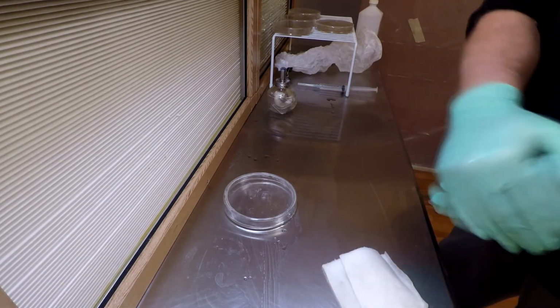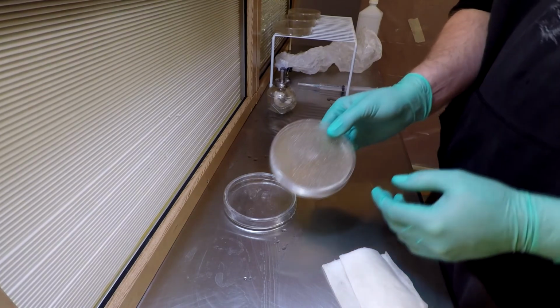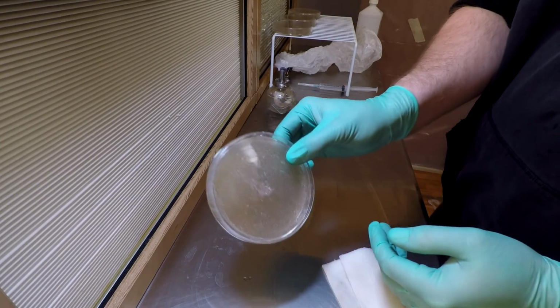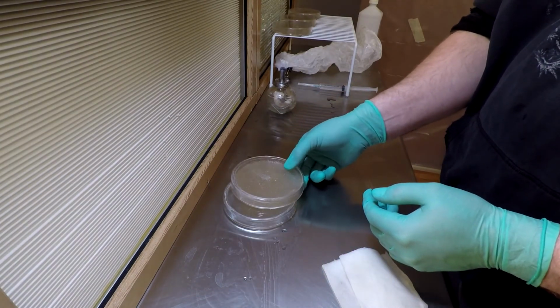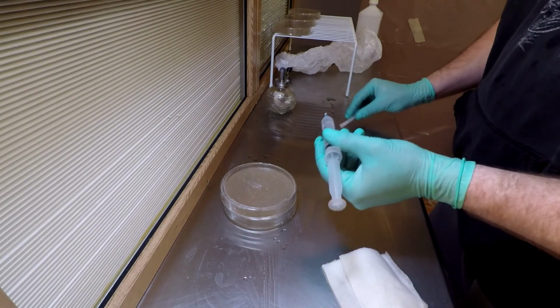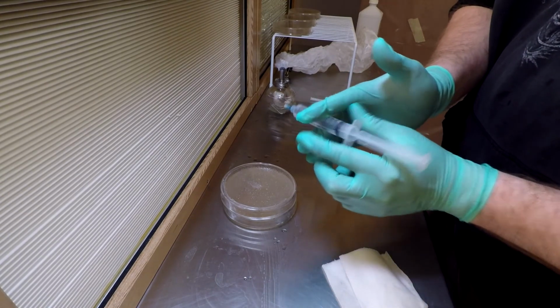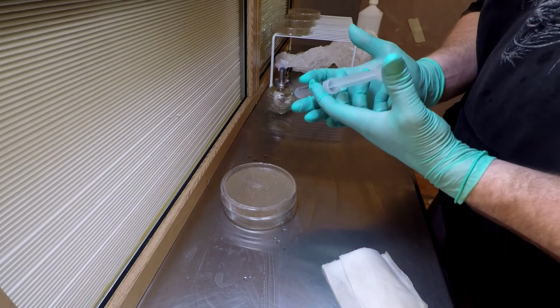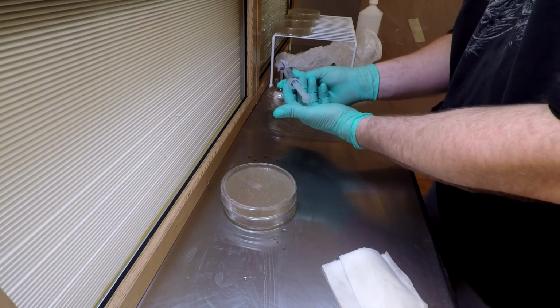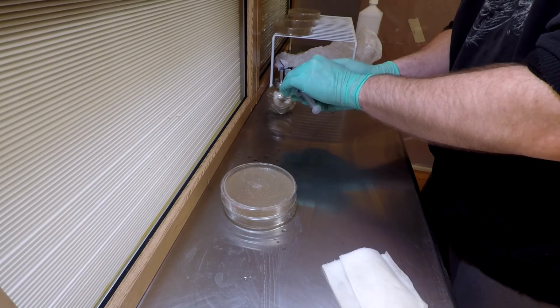Alright, let's see. Now this time, see, I don't have the charcoal in it. It's the standard color, kind of a peachy tone, tan tone. I've already been using this, so I don't really need to sterilize it again. Half sterile as well. Well, actually, I'm not 100% sure on that. Never hurts to re-sterilize your tools when you're not sure.